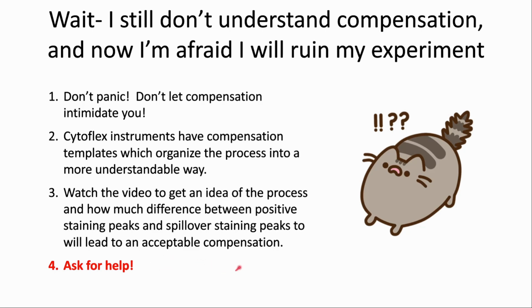This video was recorded on one of our Cytoflex instruments, and although I am slightly off with which log tick mark I'm at, the differences in relative intensity between the positive peak and the spillover peaks are what is important.